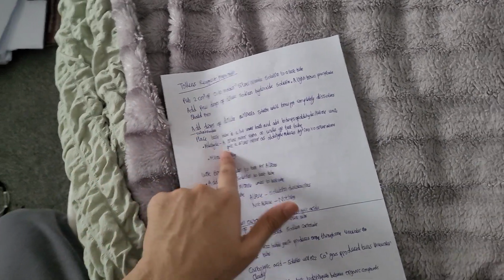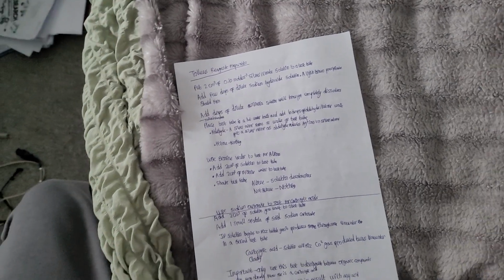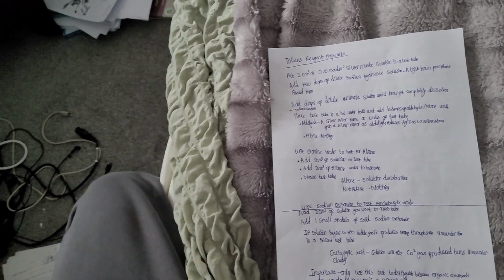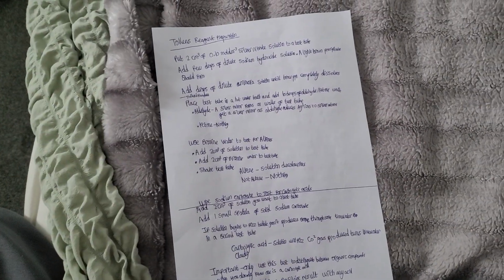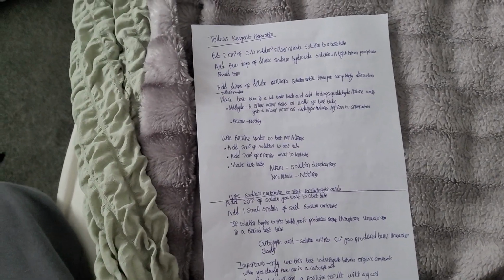Now, how to identify whether it's an aldehyde or a ketone. Place the test tube in a hot water bath. Add 10 drops of the aldehyde or ketone. Wait. If it's an aldehyde, a silver mirror forms on the walls of the test tube, as the aldehyde reduces the Ag+ ions to silver atoms. If it's a ketone, nothing happens. I should be more explicit: no reaction, no color change, no observation.